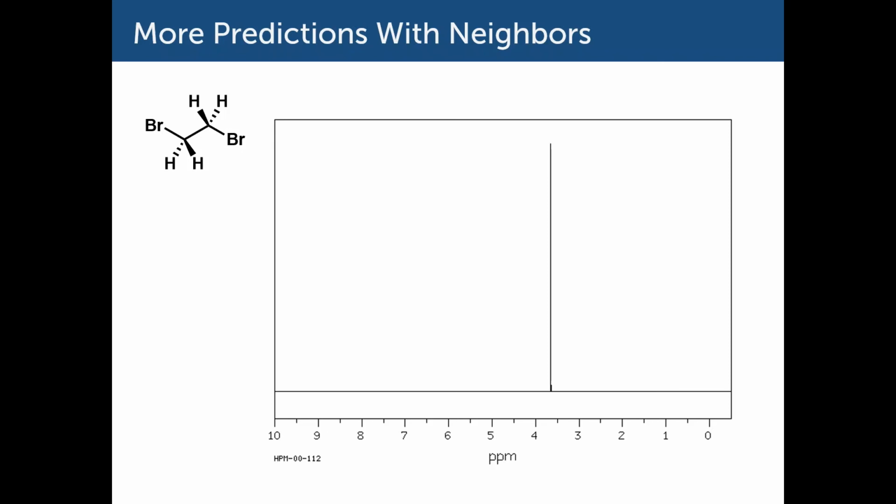So in the remaining videos of the series, we'll look at some advanced topics in thinking about chemical shift, and then we'll also be looking at what's called heteronuclear NMR. It turns out that you can do NMR on atoms other than hydrogens.